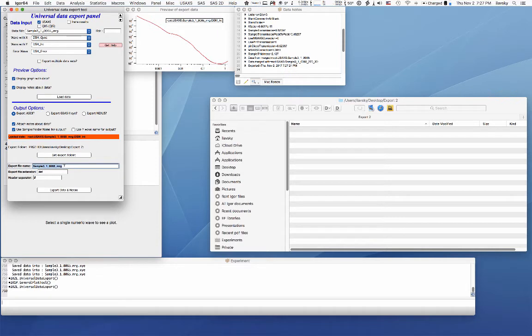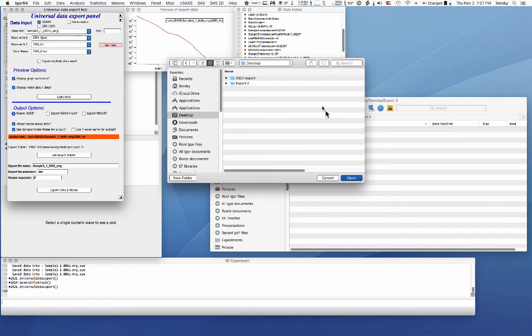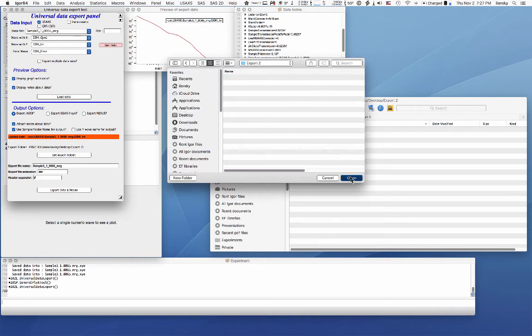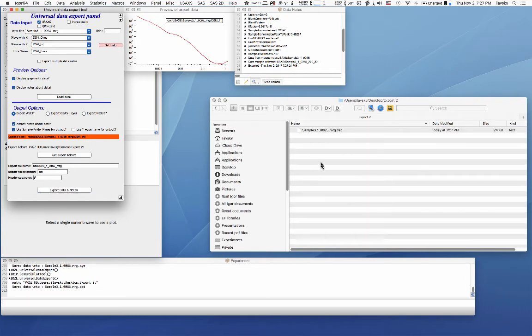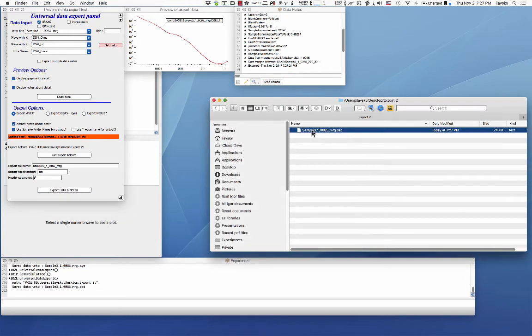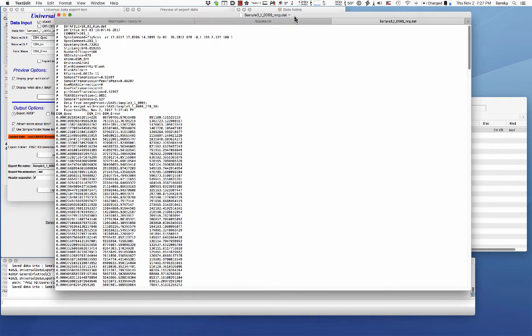So now you have this name here. It's going to have an extension .dat. It's going to have a separator, which is a pound space and then something behind that. I'm going to set the export folder to this specific folder here. And then I'm just going to hit export data notes.